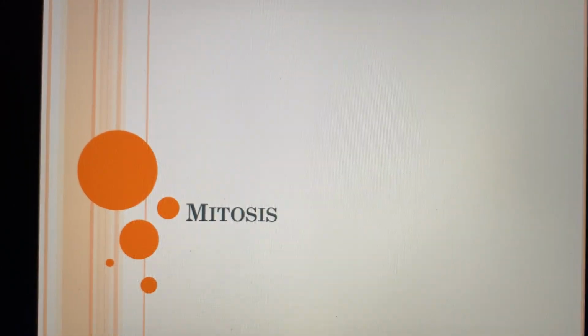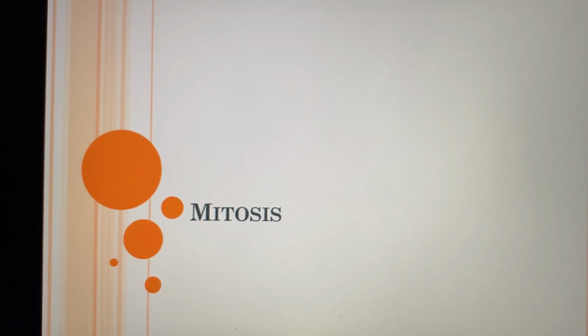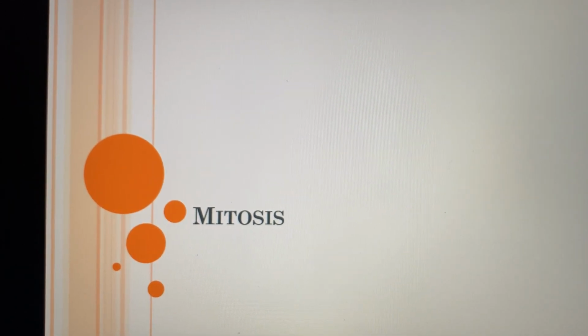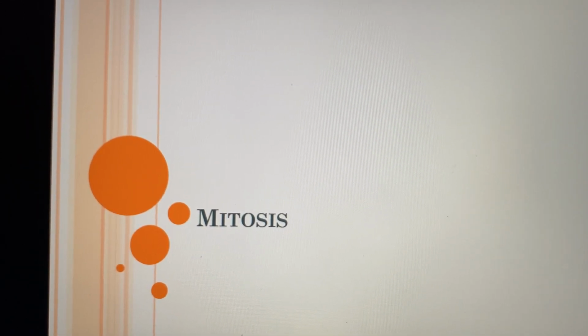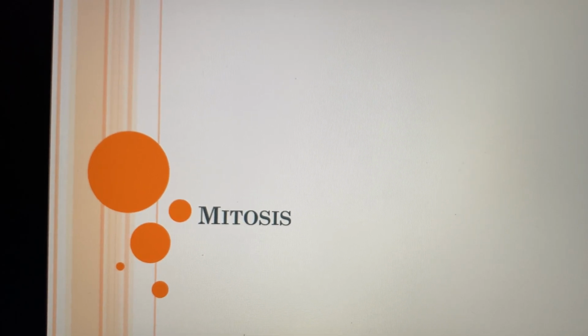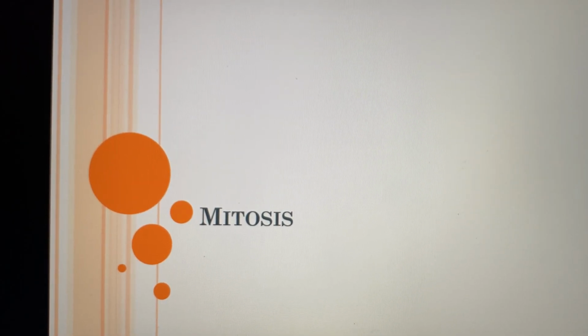Usually when we are in the lab, we use microscopic slides and we view phases of mitosis. This is the name of our experiment today. But since we are doing this online, I will teach you about the phases, how we look at them under the microscope, how they look under the microscope, and I will give you a very small assignment. It is not a lab report, it's just a small assignment.